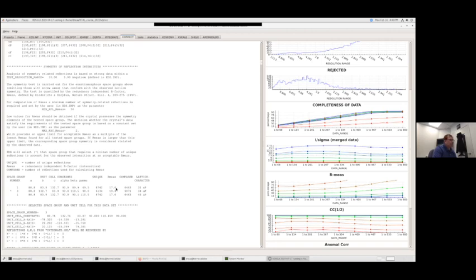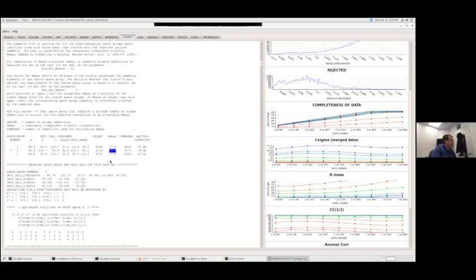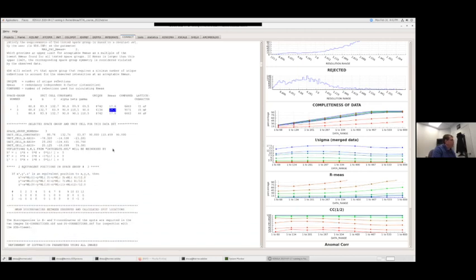Catherine, I'll answer your question about the resolution in a second. So here, the R measure of the triclinic is sort of your baseline. And what you're looking for is the highest symmetry space group that gives you an R measure that doesn't jump up significantly. Okay, so you can see here the monoclinic is only 2 percentage points higher. So it's still relatively confident that you can select the monoclinic space group.